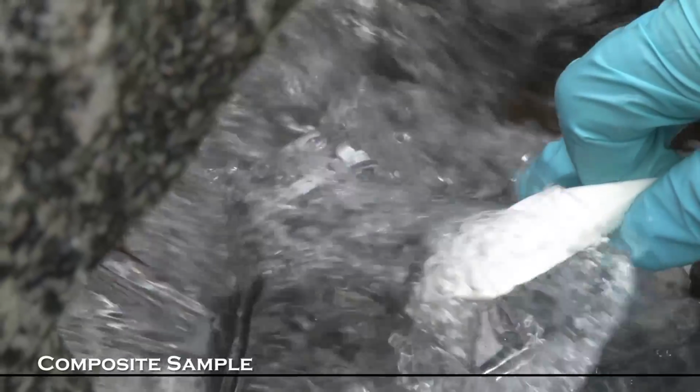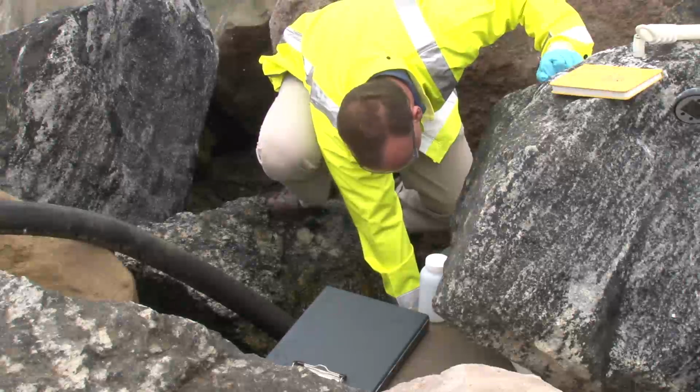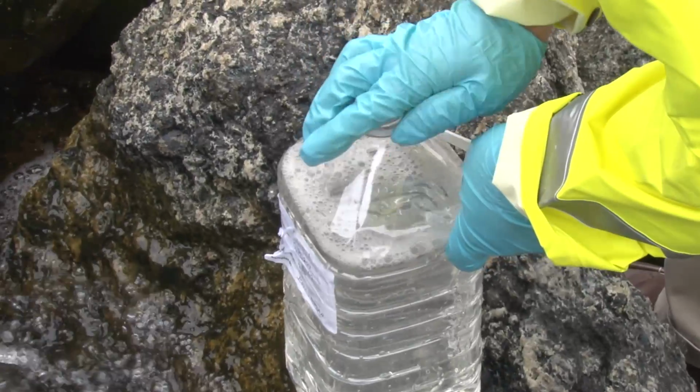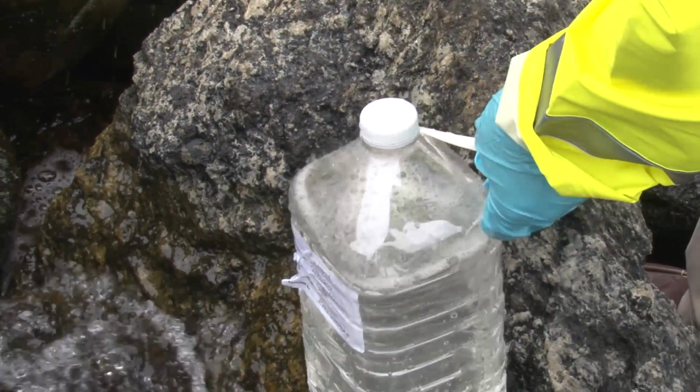Composite samples are collected so as to be representative of a flow stream over time. They are actually grab samples that are mixed together in a specific ratio at the end of the sampling effort to form a single sample used at the laboratory. Composite samples are used to provide data on the average composition of the stormwater discharge.